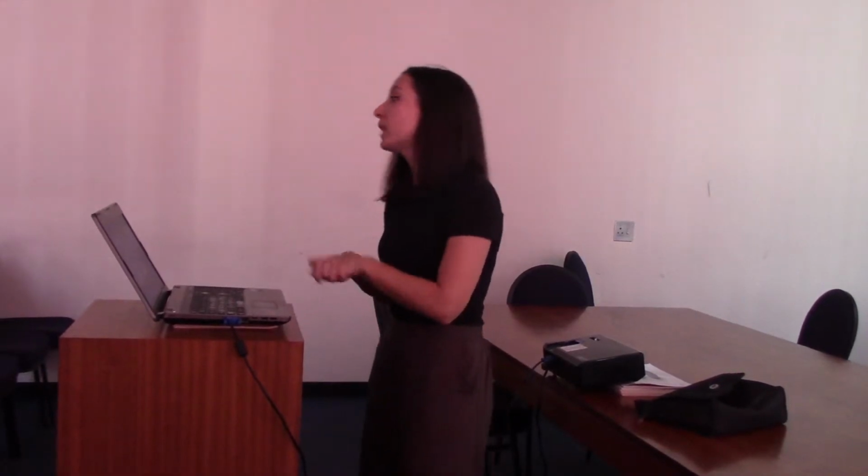So there are 2 blogs or resources that I've tried to put there, the RNA-Seq Blog and RNA Sequencing, which try to consolidate all of the different tools that are available. I really encourage you to explore these blogs. I'm sure a lot of you have, Marina, you've probably seen it. They really detail each method that you can go through, what the pros and cons are, and exactly what you need to take into account.